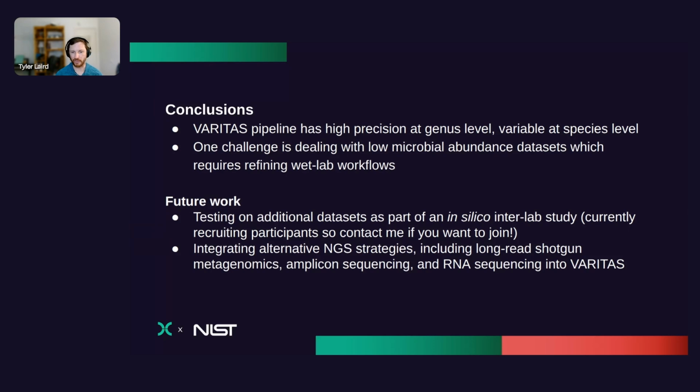So if this sounds like something you're interested in to help advance the use of NGS for sterility testing of biotherapeutic products, definitely contact me if you'd like to join. As part of the actual pipeline, we'd like to integrate alternative NGS strategies, including long read shotgun metagenomics, amplicon sequencing, and RNA sequencing.